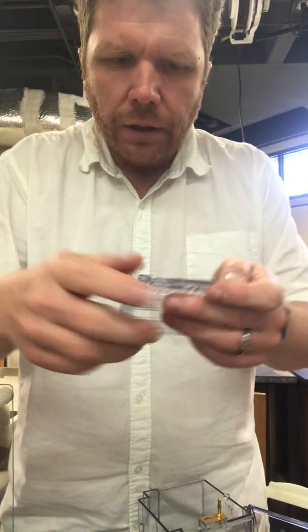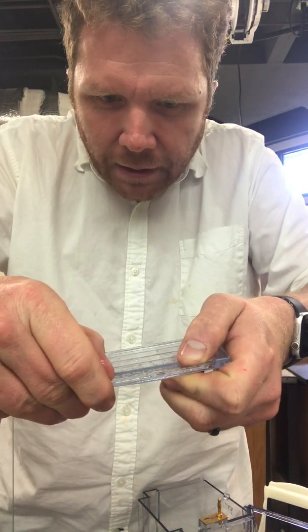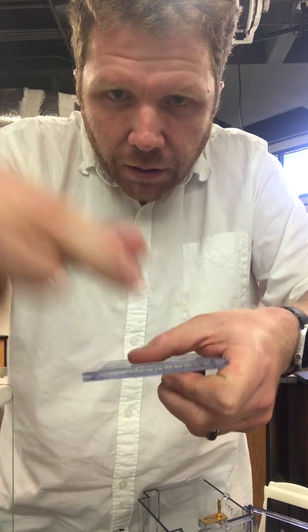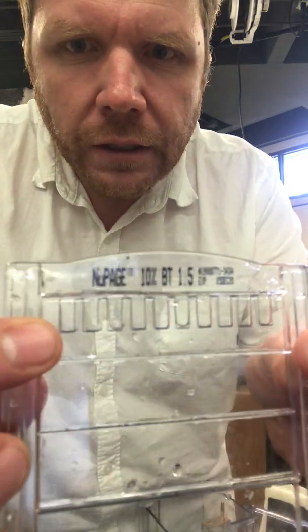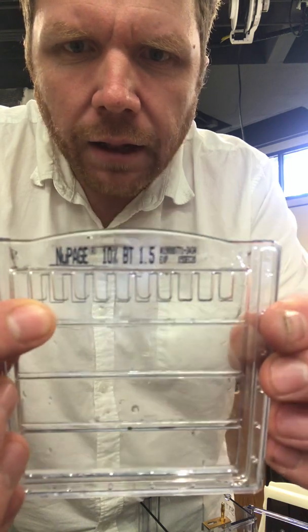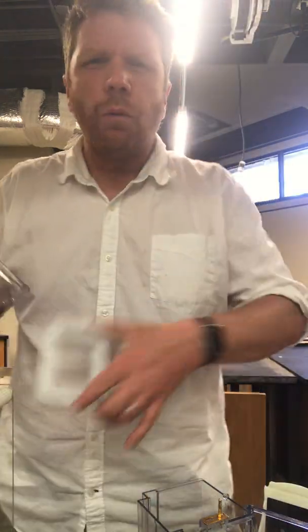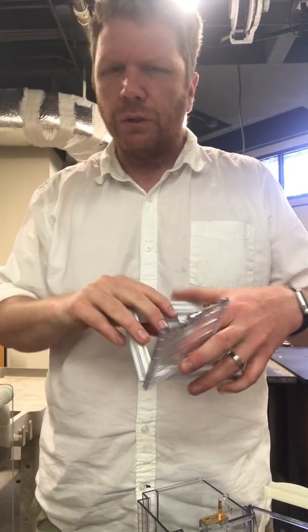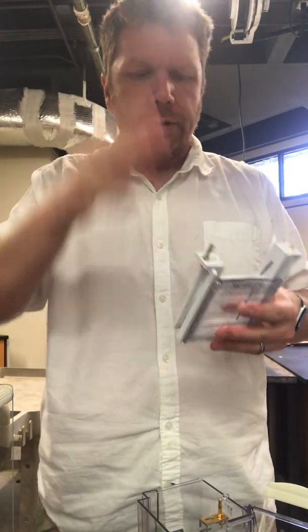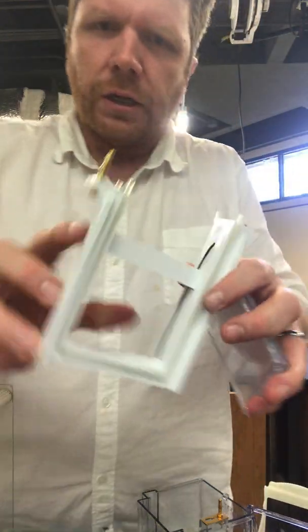Now the next part is at the very top. You have this piece of plastic that has these little teeth, and that helps form your wells. One thing that I like about precast gels is this dotted black line that gives you the outline of where the wells are. That's helpful when you're loading, so you can visualize them rather than looking through a clear thing for some sort of refraction of the light.